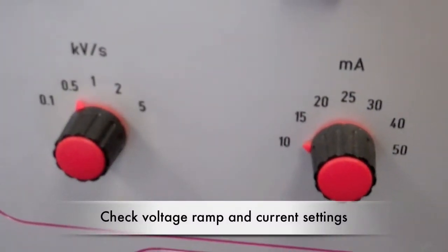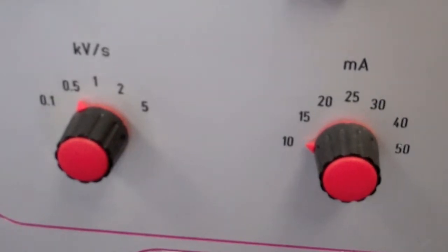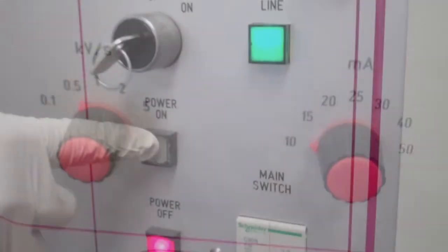Make sure the voltage ramp is set to 0.5 kilovolts per second and the current to 10 milliamps. These settings may be different depending on your specific test.